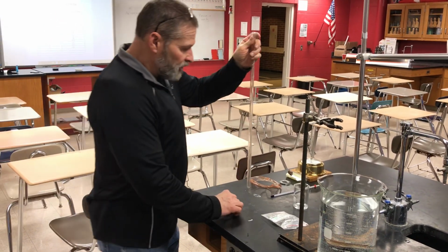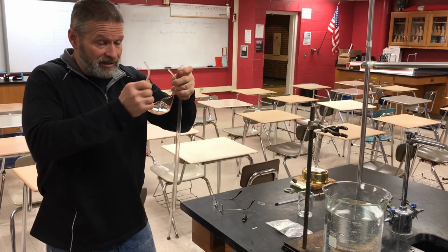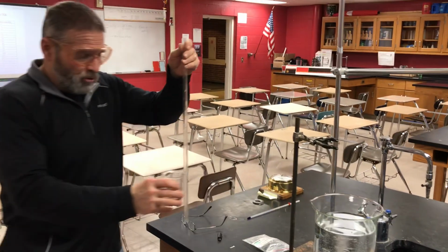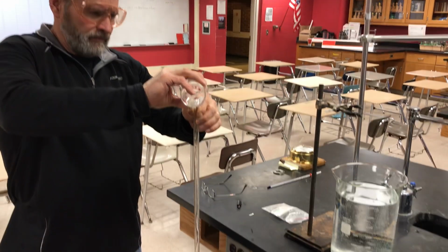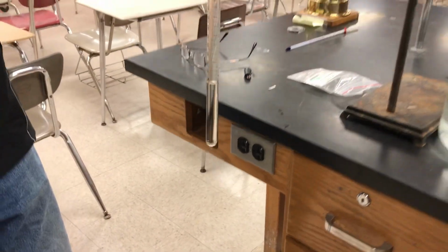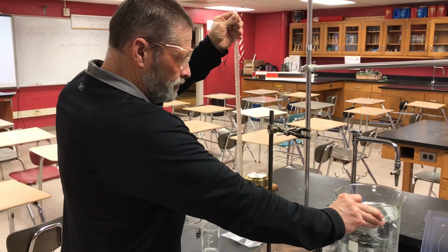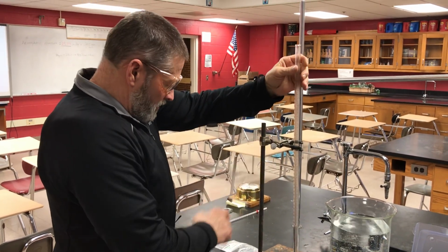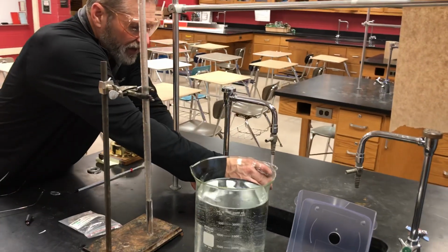Okay, so first thing I'm going to do is put on my safety goggles because it is concentrated HCl. All right, I'm going to pour that into our eudiometer. Okay, so there's our concentrated HCl. I'm just going to clamp it here for a moment. Okay, now I'm going to get some tap water, so we'll add to that.